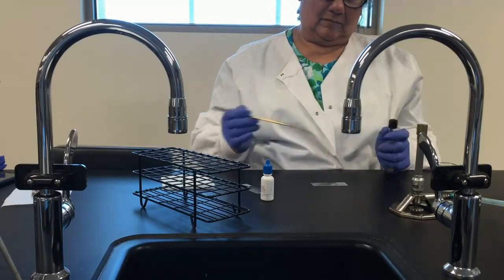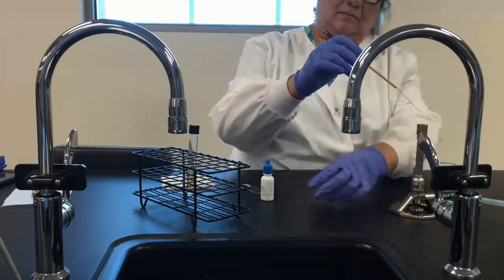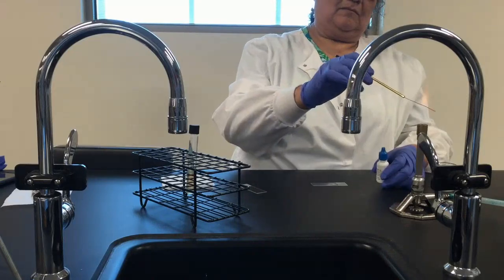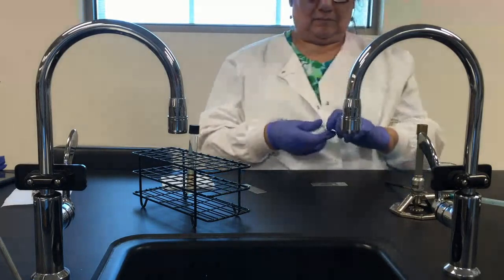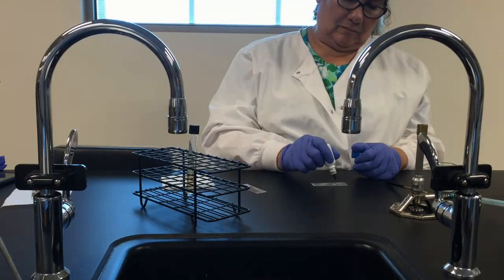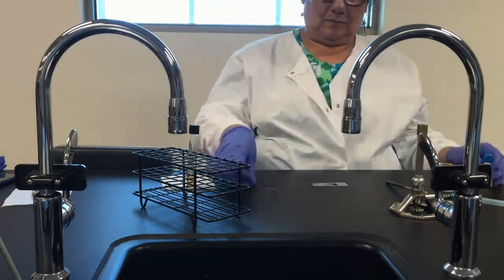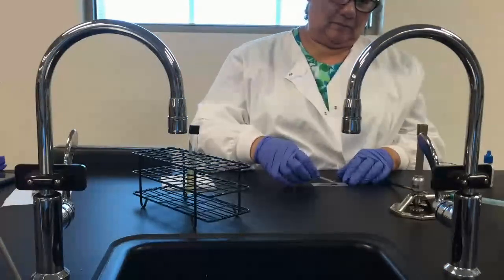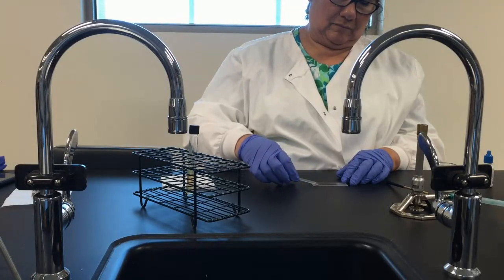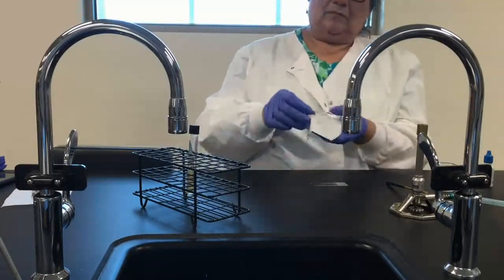All right, after we do that, we're going to add 1 drop of India ink to the water and organism mixture. Now, please take care not to touch the tip of the bottle to the water, or you're going to contaminate the entire bottle of India ink. All right, once we've done that, we're going to pick up a second microscope slide, and we're going to use it to drag that material across the entire surface of the slide.